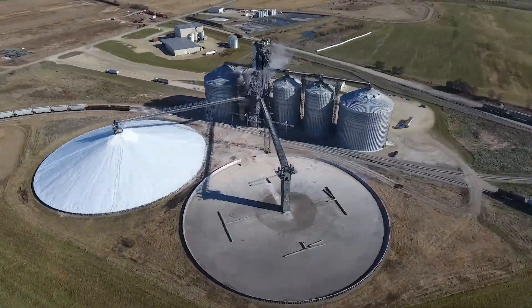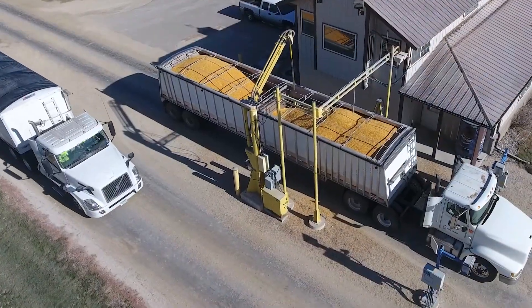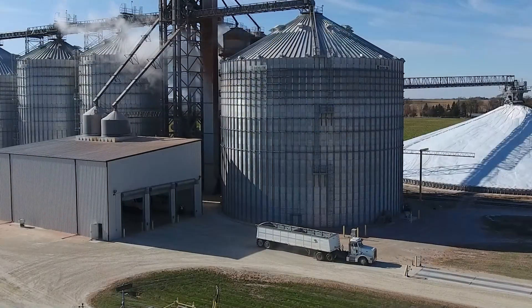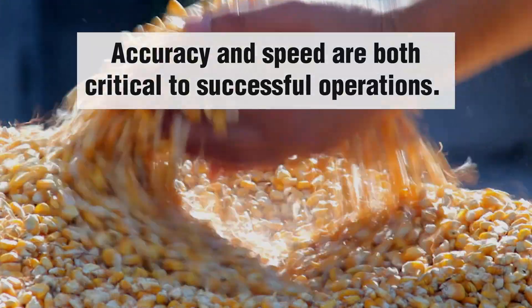Today's commercial grain trading operations are high pressure environments where a flow through of incoming trucks and outgoing shipments must be timely to achieve optimum profitability. However, accuracy cannot be sacrificed.